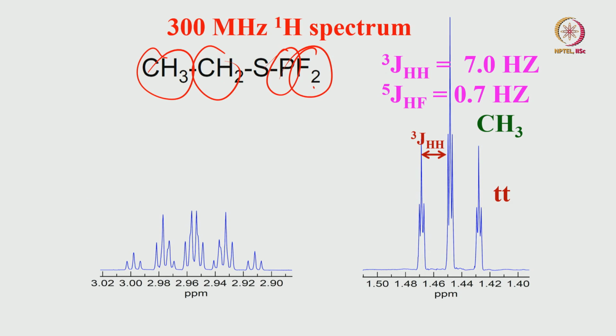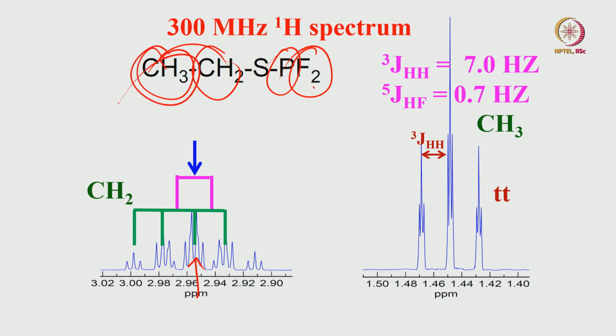We will start like this for this molecule. Let us say that is the chemical shift. It is always at the center of the multiplicity. I told you that this CH2 proton initially splits into a doublet because of phosphorus coupling, because that coupling is larger. That is how I have worked out the multiplicity pattern here. Then it also has a coupling to this. This is the second largest coupling.